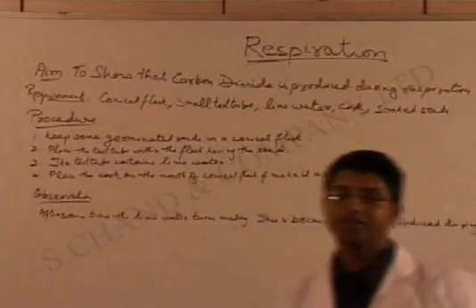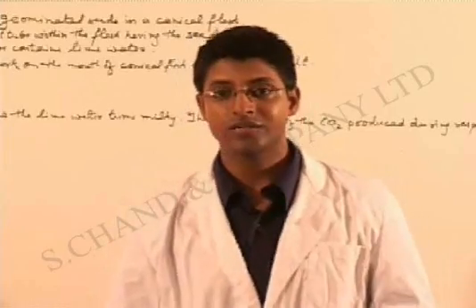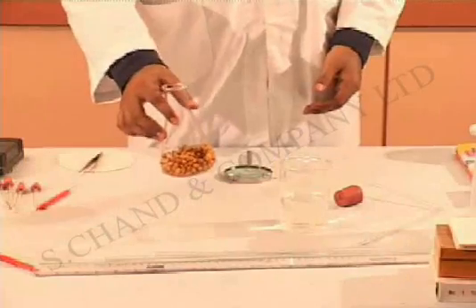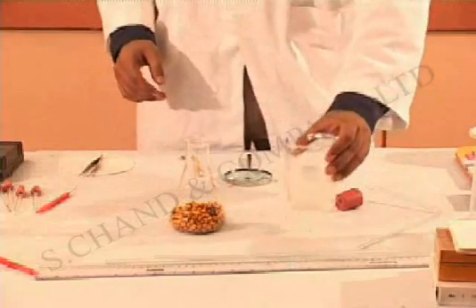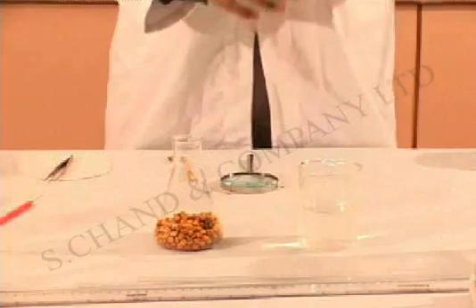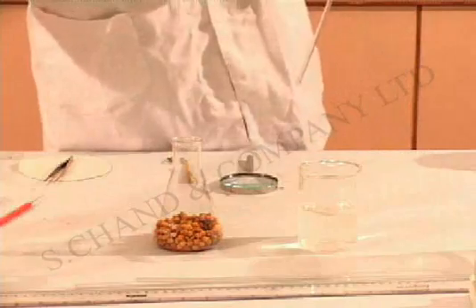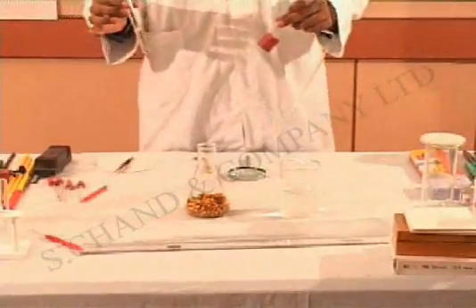This is a very simple experiment and I am going to show you just how to prepare the apparatus. As you can now see, we have a conical flask here with the seeds and a beaker full of water. There is a delivery tube with a cork attached to it, and then there is lime water which will prove the presence of carbon dioxide.